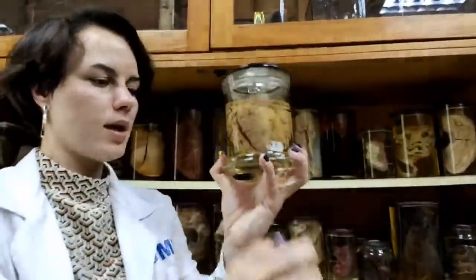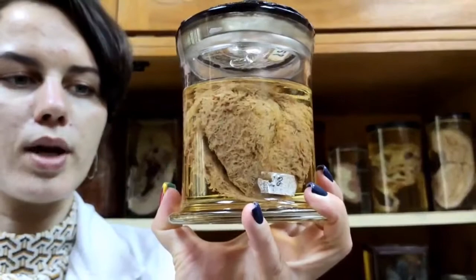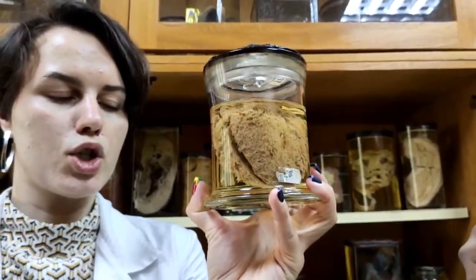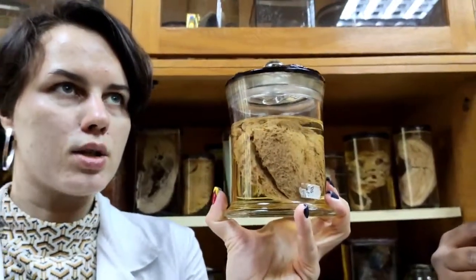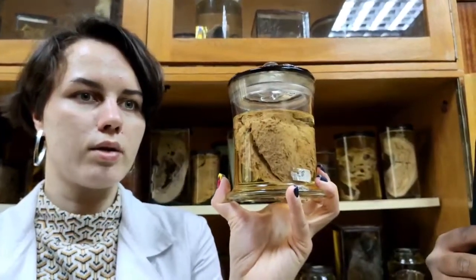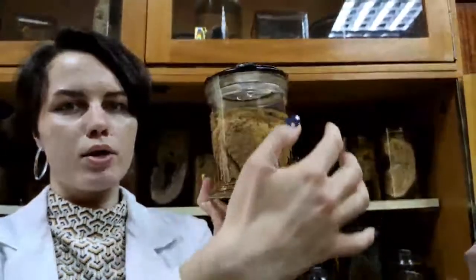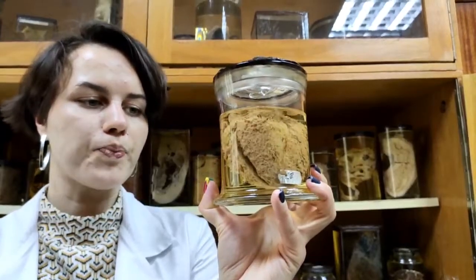The next specimen is so-called hairy heart, or fibrinous pericarditis. This is a disease usually in patients with chronic inflammatory conditions, for example, which were complicated by secondary amyloidosis and chronic kidney insufficiency, and they have multiple fibrinous accumulations on their visceral pericardium.